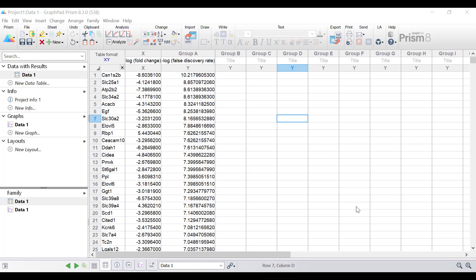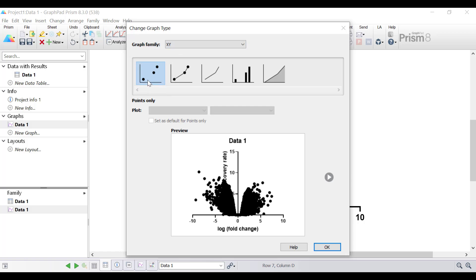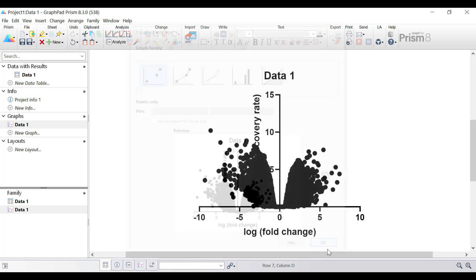Next, I will go to the connected graph sheet and select to plot an X, Y graph with points. The connected graph sheet can be found on the left-hand window. The type of graph we want is the first option under the X, Y graph family. We want to select the points only option, and I'm going to click the OK button.